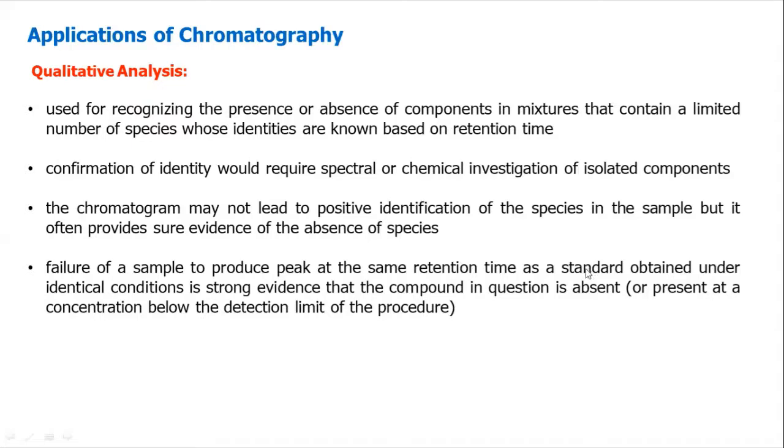But then, pag abot sa sample nato or sa atong crude sample, wala ni gawas ang peak kung asa ni gawas ang peak sa standard. Therefore, it is a strong evidence. Pwede na siya nga very sure evidence and strong evidence that the compound in question is absent. So that is for qualitative analysis.